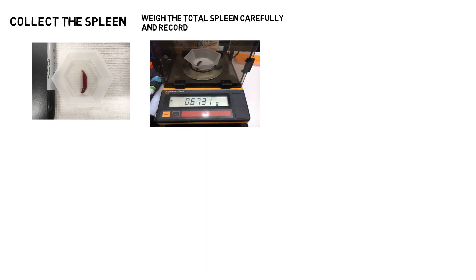This video assumes you've already collected the spleen, as shown in the culture dish. The first step is to weigh the spleen to get a total weight.